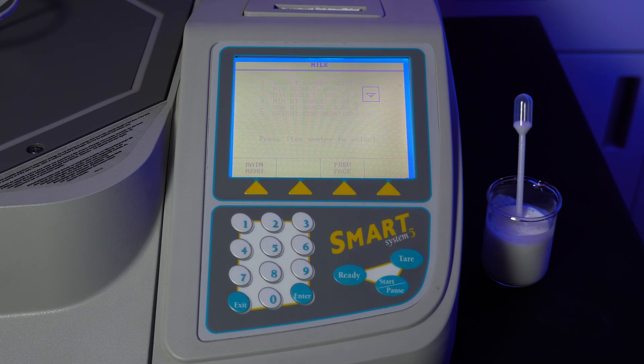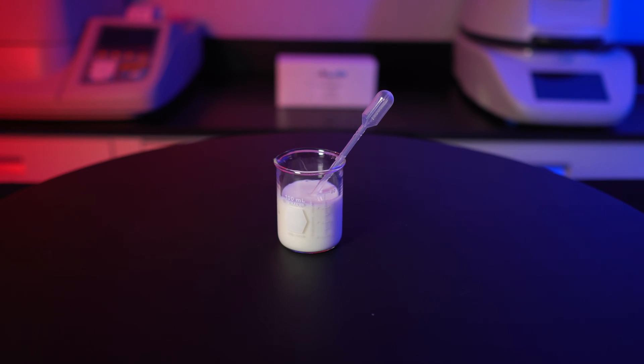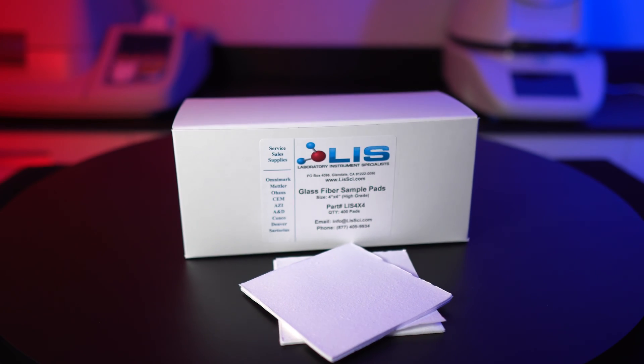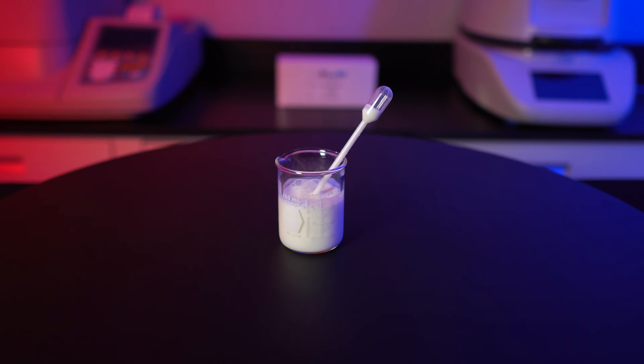That have higher temperatures when the final weight is calculated compared to the start of the test. Once done with the setting parameters, hit ready and the new method will be saved and testing can begin. For this test, we'll need our sample, 4x4 square LIS glass fiber sample pads, and a pipette to distribute the sample onto the sample pad.